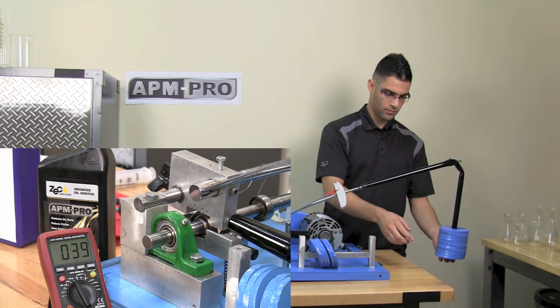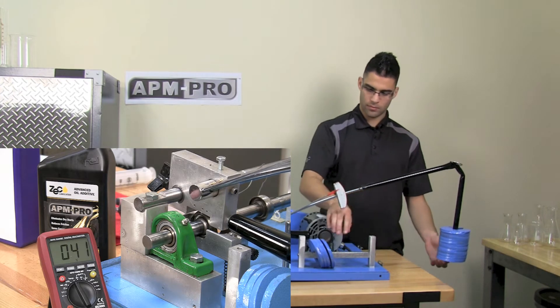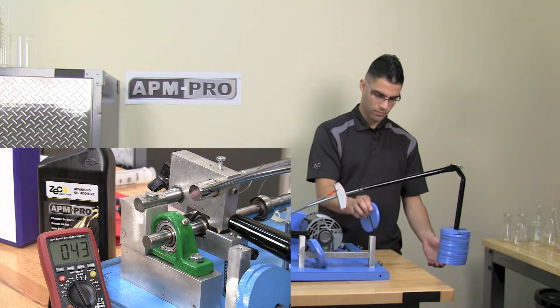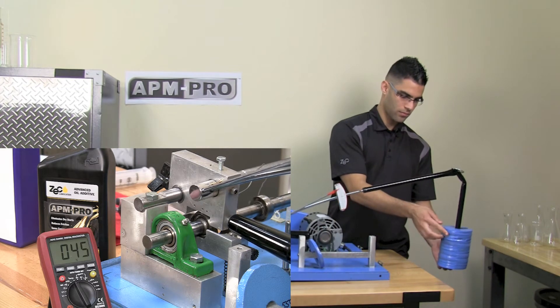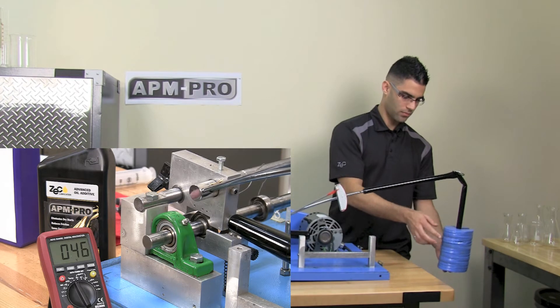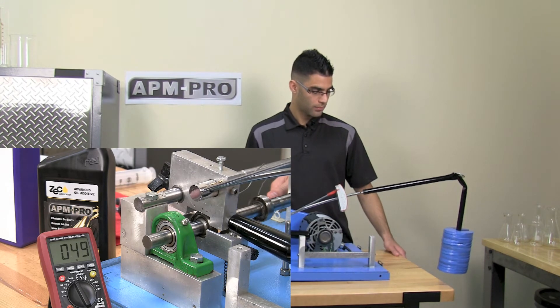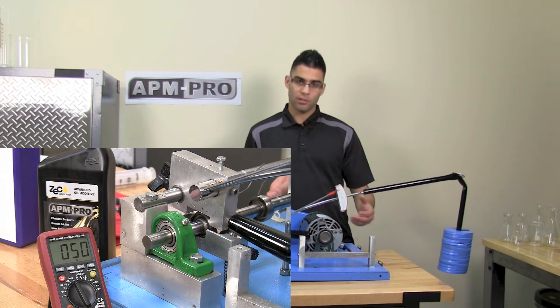We have already reached 10 to 5 minutes. We have reached all 16 weights, and it's still very quiet.